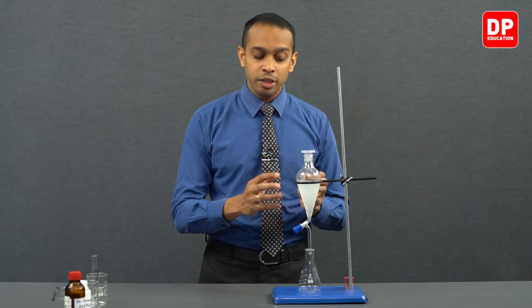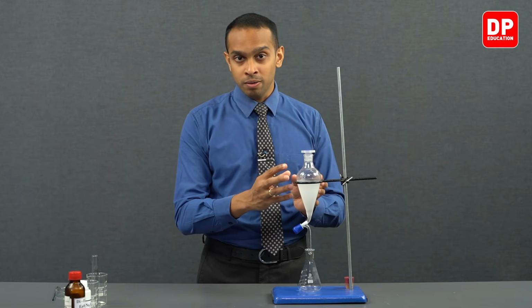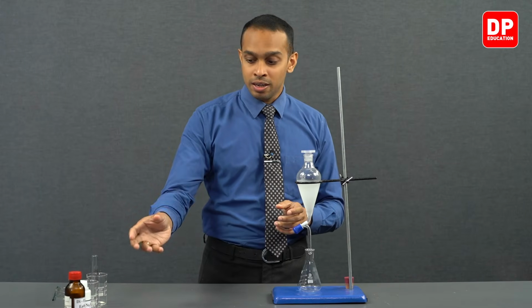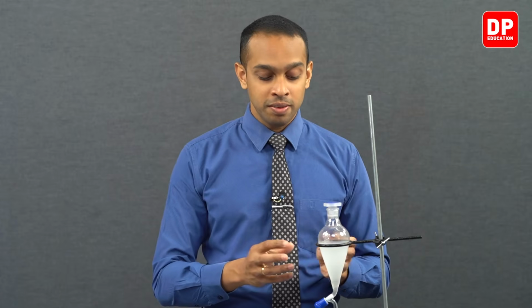However, if you introduce a separate organic solvent that can dissolve this oil better, such as diethyl ether that we have here, and mix it with this aqueous mixture, you will observe that the majority of the oil dispersed throughout this aqueous medium will easily dissolve in the diethyl ether organic solvent.